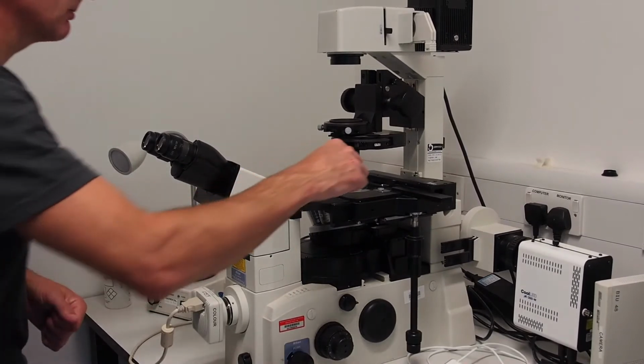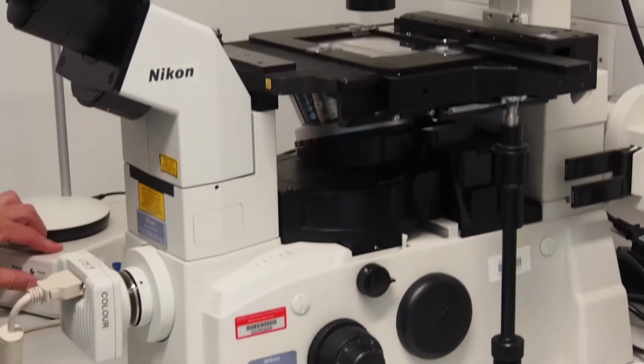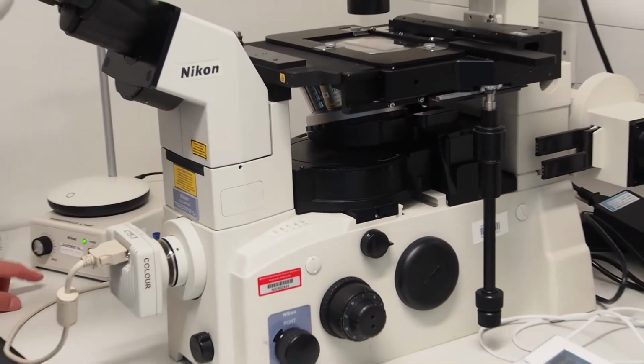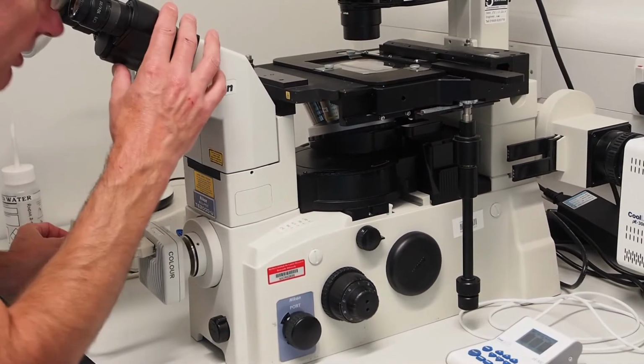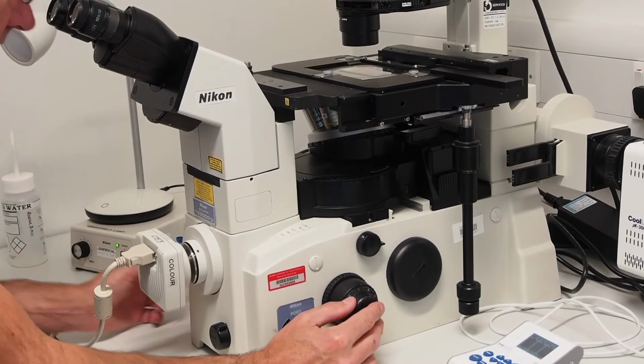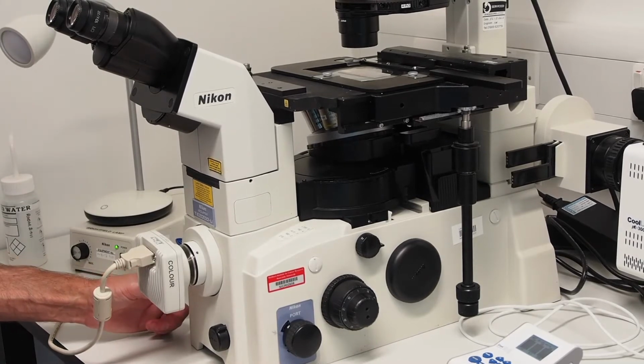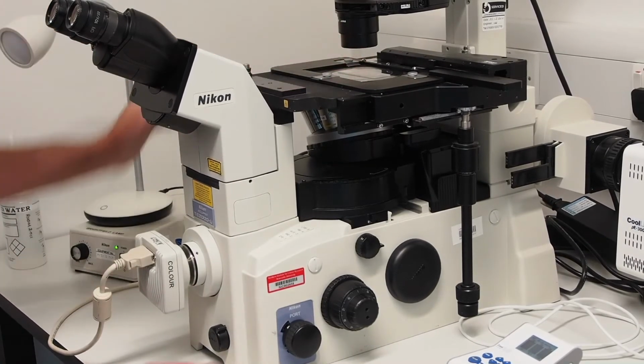While you are waiting on the computer to load, you can go ahead and load the sample onto the microscope stage. Turn on the lamp power on the control box and on a secondary switch on the left side of the microscope and turn the lamp power up as required. You should be able to see your sample illuminated on the stage and be able to focus on your sample using the focus wheel on the microscope.